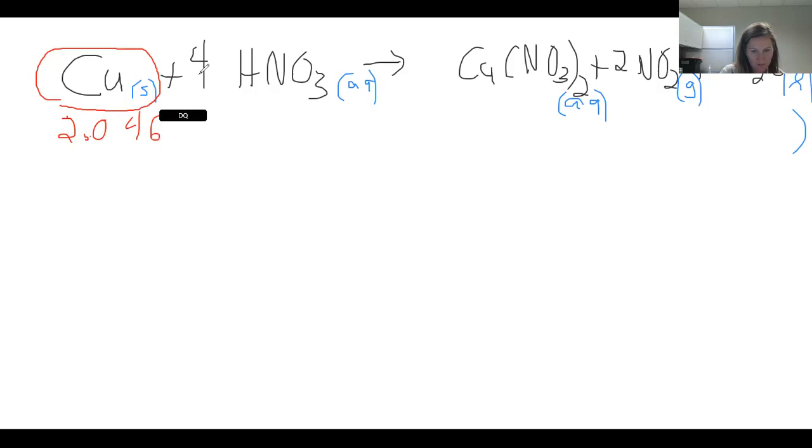2.0465 grams of it. And then we did a series of all 5 of those reactions. And in that series, the very last reaction was a single displacement reaction with copper and zinc. So I'm just going to write that reaction quick so you can see what they're trying to get at here.